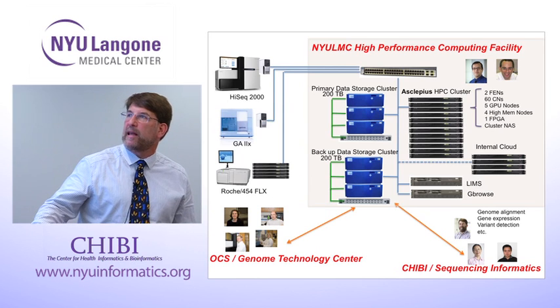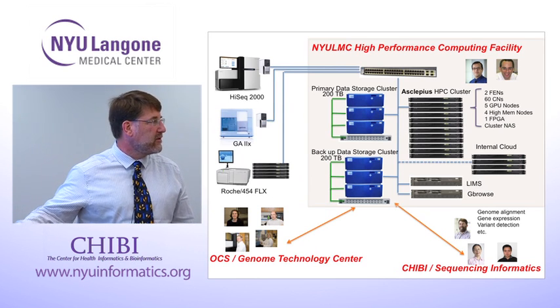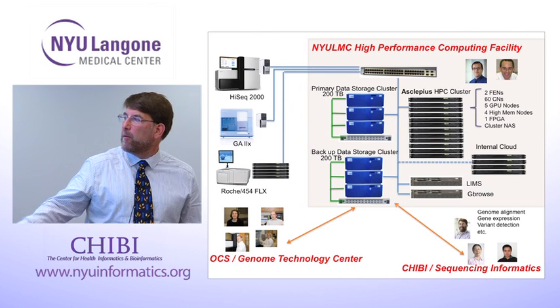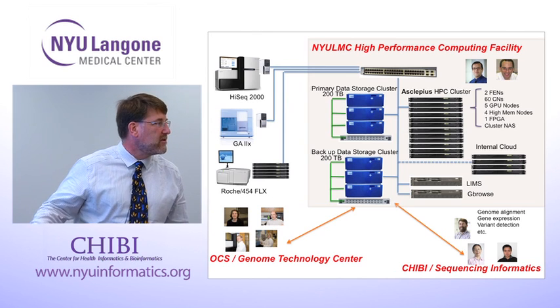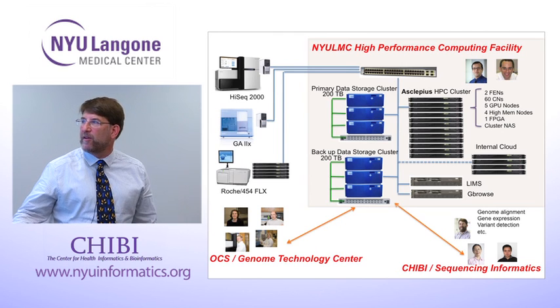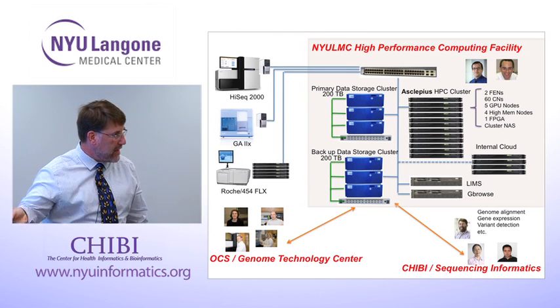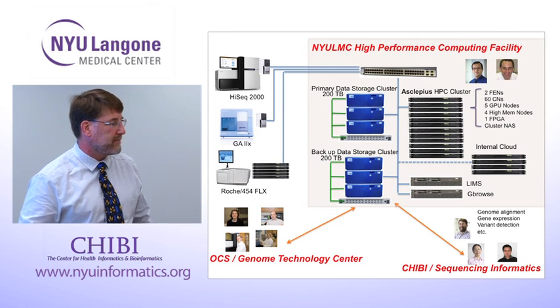We had the system set up so that the sequencer writes the data directly onto our hard drive array, and then we have direct access to it to run the data analysis algorithms, and then you in the lab, wherever you may be, can get direct access to the raw data and our analysis results.